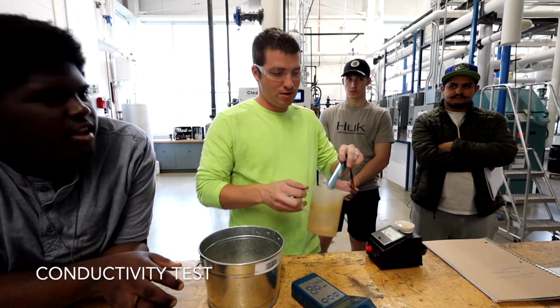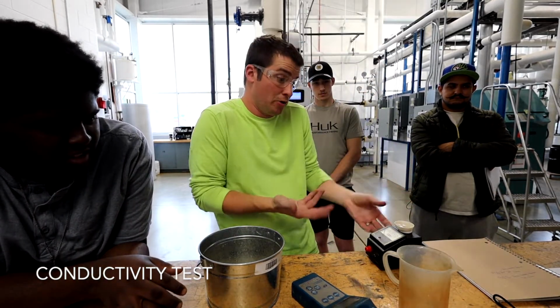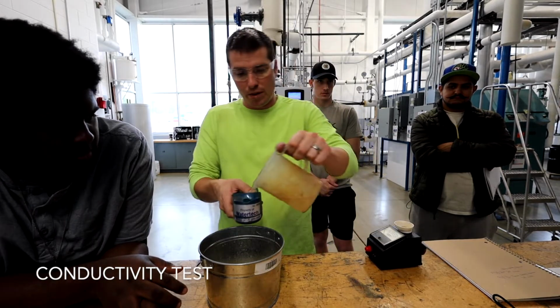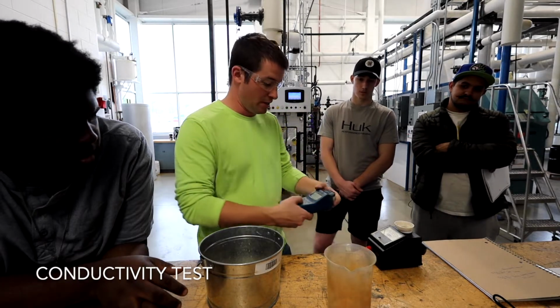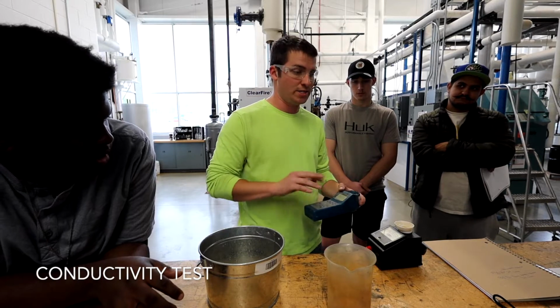$69.2, what a number. All right, so 69, right? This was sub 100. I can't tell exactly what, but I would say it's reading pretty accurately. Or maybe you have one like this, right? And again, maybe you'll have an easier time. So I'm getting 66.